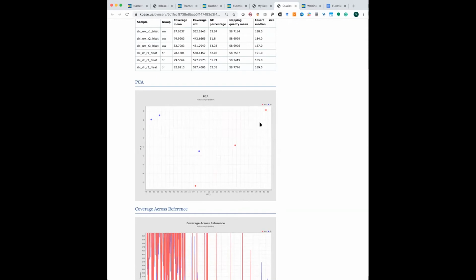So it's not terribly dissatisfying. I mean, we have these 3 libraries which are on this side of the screen, and there are the other 3 on this side. It's only if they are all randomly spread out that I may want to look at why I do not see some kind of a common pattern, because I may be expecting some sort of underlying theme for my treated samples versus my control samples.